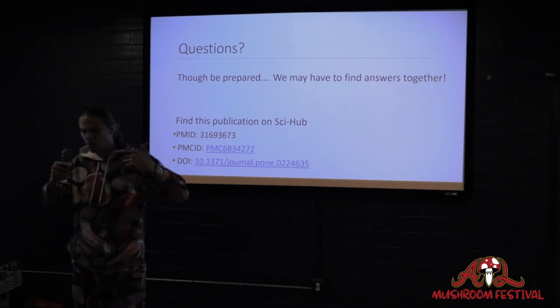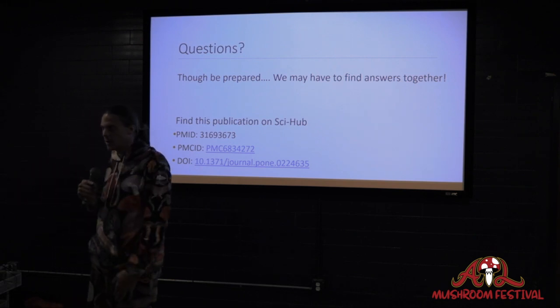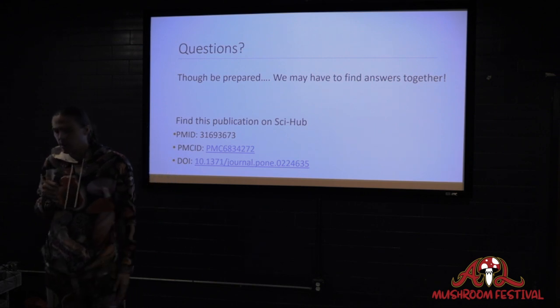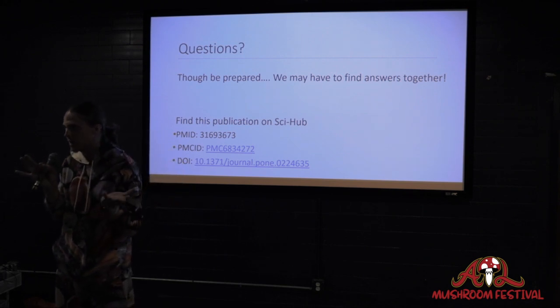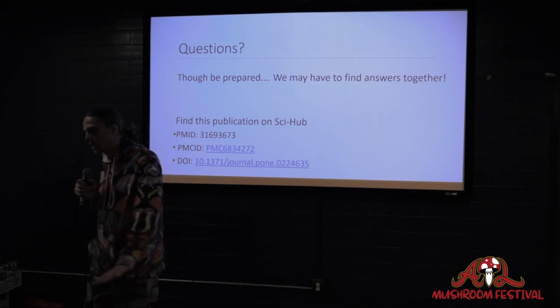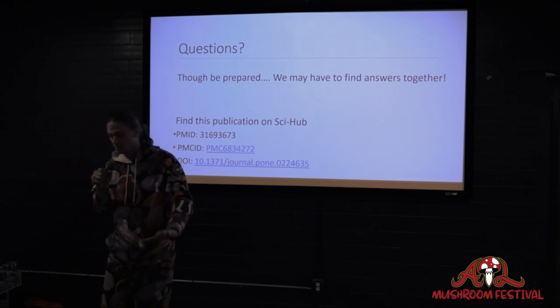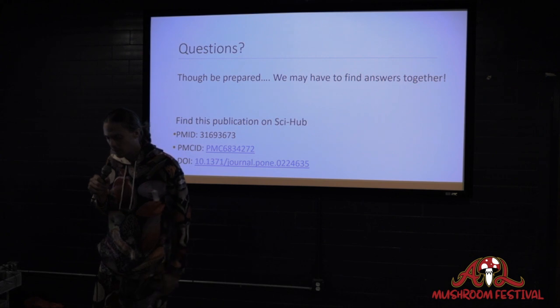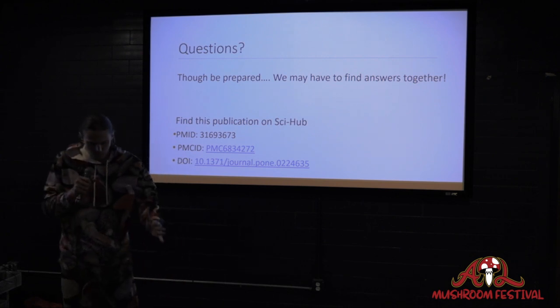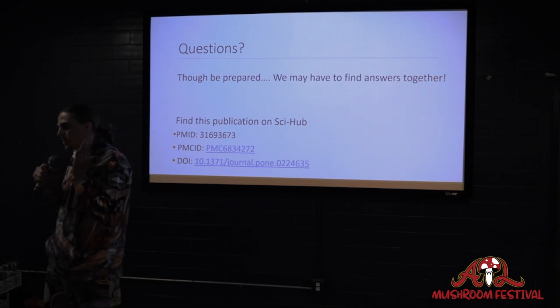Fungal contaminants do not cohabitate like yeast or bacteria contaminations can. And yeah, yeast is a fungi, but it's different. So it's more fluid in the way that it interacts with its environment. And so you can smear that around just like you can bacteria and get similar results, at least as far as contaminants are concerned. But when dealing with Ascomycetes and most Basidiomycetes that you're trying to run away from, you can usually tell the difference in the morphology of the mycelia and then be able to select away from it.